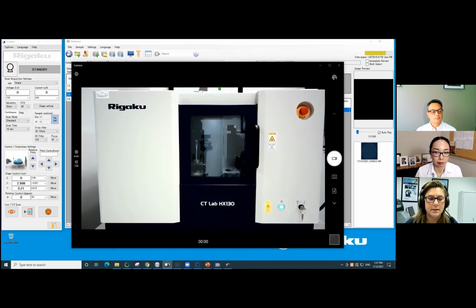So if our time frame for the absorption of this is extremely fast, then we have to be able to collect extremely fast to see the change of the sample over time. Now, something that is very slow, you don't need to have fast scans. Now, it is always important to choose the right energy, but you'll choose that based on the sample type. And again, I'm going to refer you to that webinar number 3 if you're interested in knowing how to do that. And then last, we asked you about the field of view.